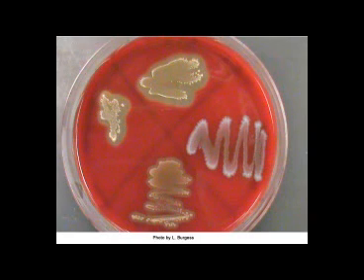Beta hemolytic strep are classified as group A streptococcus by the Lancefield classification system. They also tend to be the most virulent of the streptococci. Blood agar is used extensively in diagnostic laboratories for the identification of hemolytic activity in infection-causing bacteria.